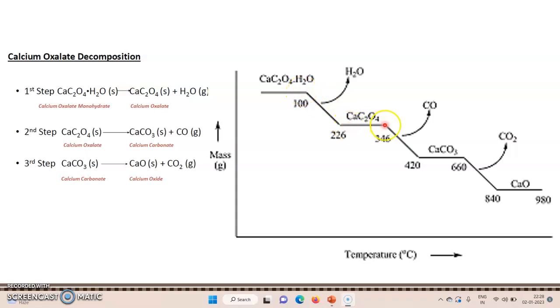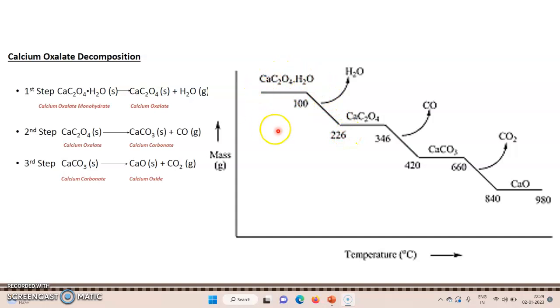This is to understand what is taking place during the decomposition process. First, we start with 100% weight of calcium oxalate monohydrate. We take temperature on the x-axis, starting from room temperature. When we heat the sample up to 100°C — which is the boiling point of water — the water of hydration associated with calcium oxalate monohydrate begins to be removed. Calcium oxalate monohydrate is stable up to 100°C.